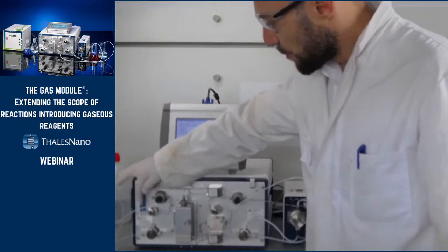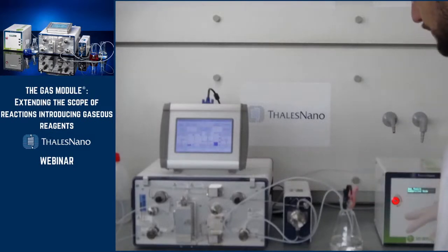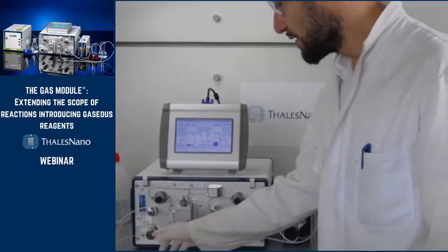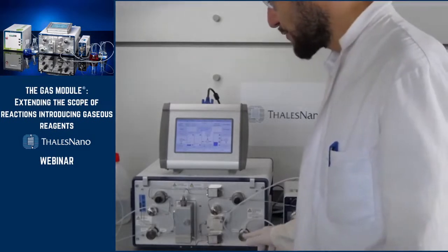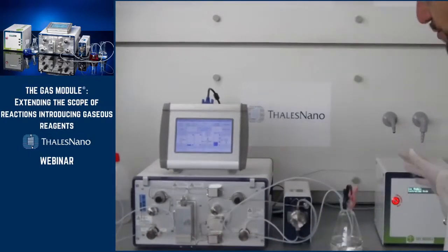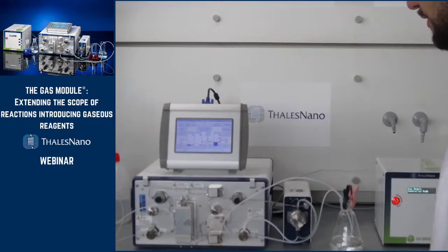And then it goes to a back pressure regulator here, which creates the pressure through all the system, from the pump to this back pressure regulator. And then it goes to another two-way valve, in the same way as the first one, but to either collect your product or just send the solution to waste. So here was the description of the H-Cube.